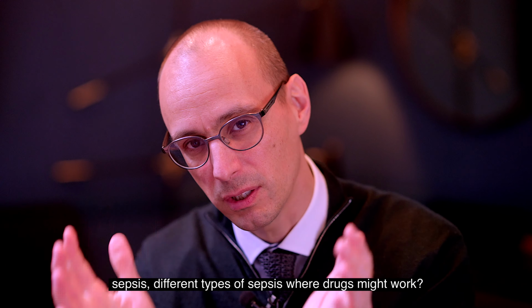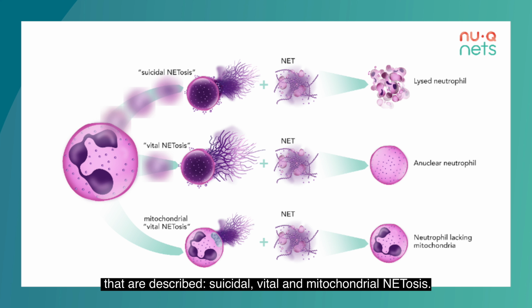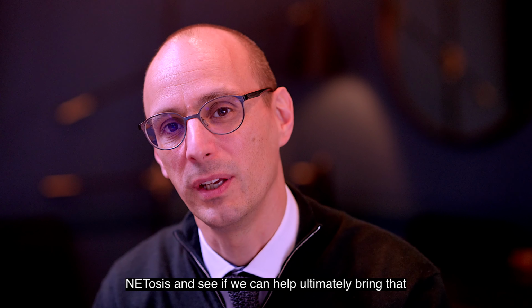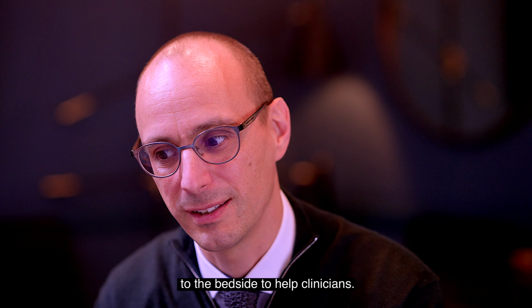This slide, you've seen before. It's picking up the different types of NETosis that are described: suicidal, vital, and mitochondrial NETosis. And we're definitely not there yet, but you can see a direction of travel for us to try and understand NETosis, try and tease out the different types of NETosis, and see if we can help ultimately bring that to the bedside to help clinicians.